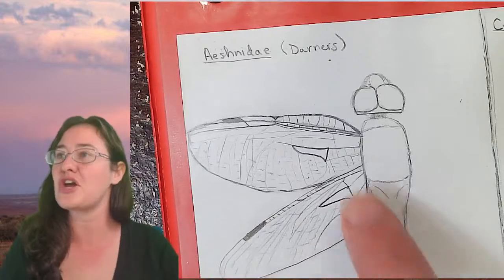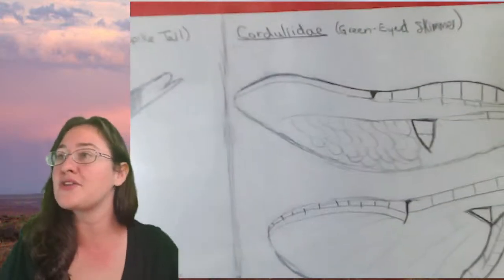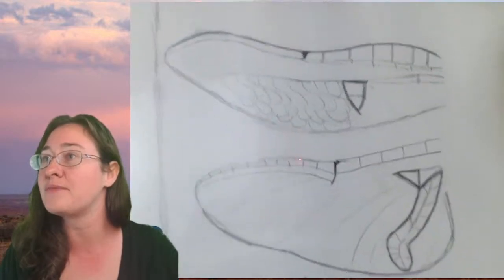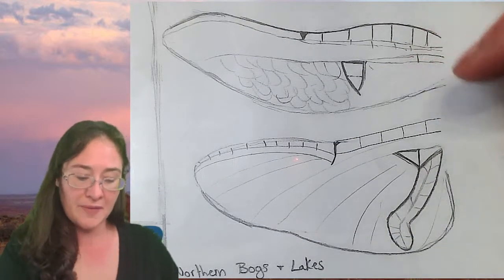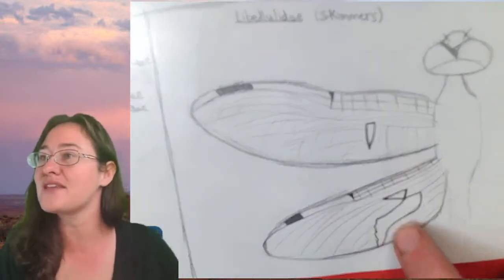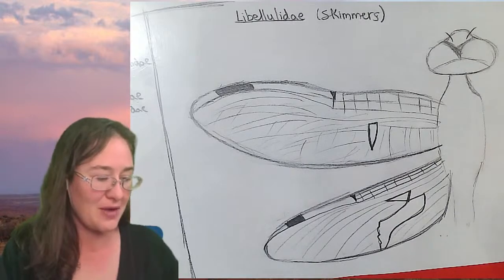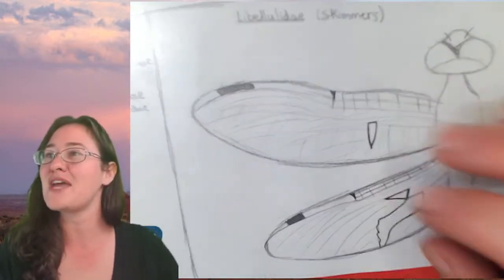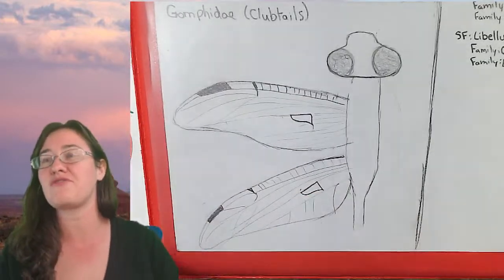Like Aeschnids, the darners, they've got these two very similarly sized triangles in their wings, whereas Corduliids have a boot in their hind wings with these sort of shaped triangles versus the skimmers who also have a boot and two triangles. So if I'm sketching dragonfly wing venation, they look more like this than knowing every single characteristic. I'm mostly looking for the shapes in the wings that help with identification purposes.